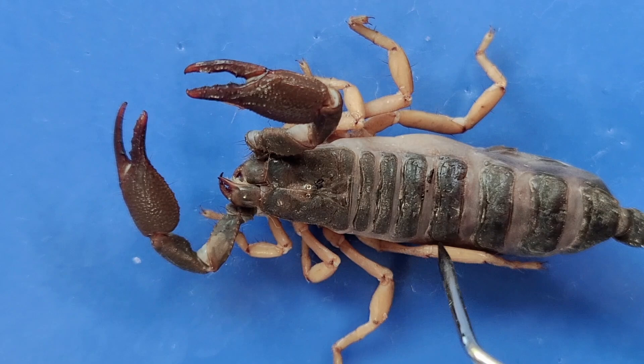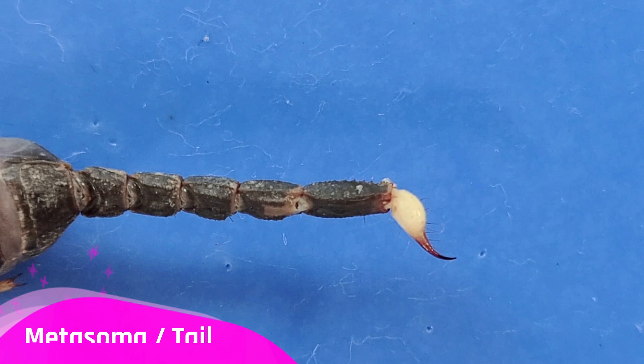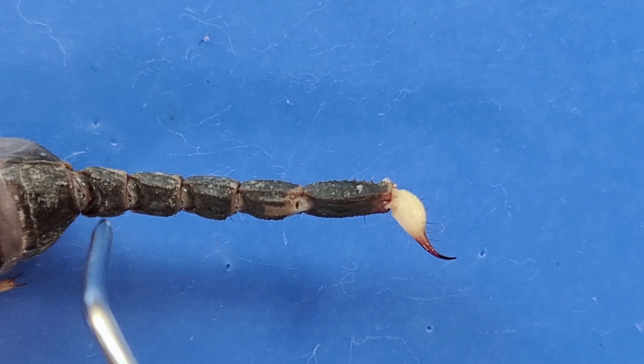They also have eight walking legs. Now here's this long tail, which is also called the metasoma.